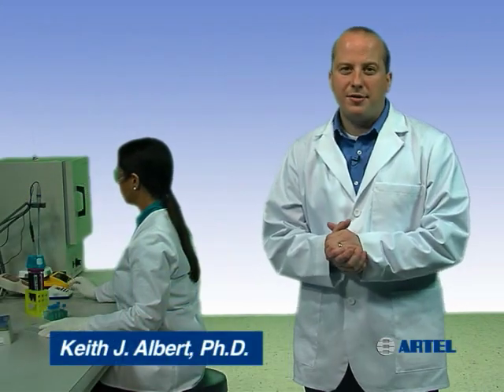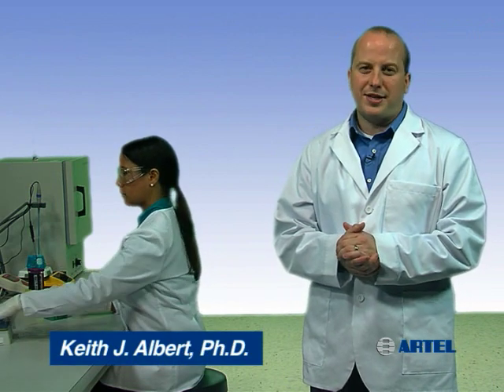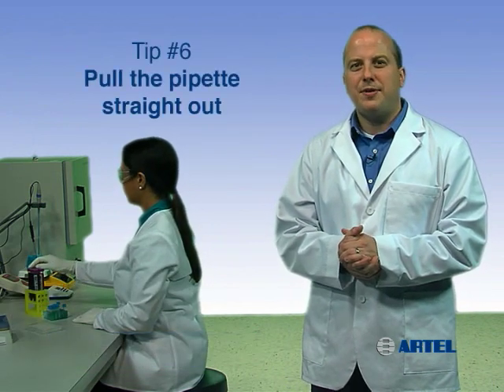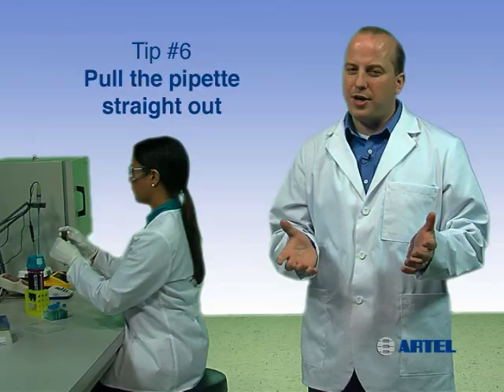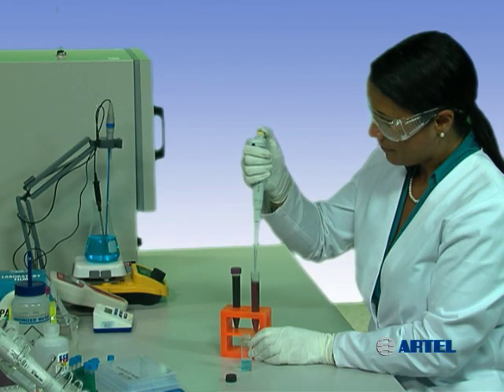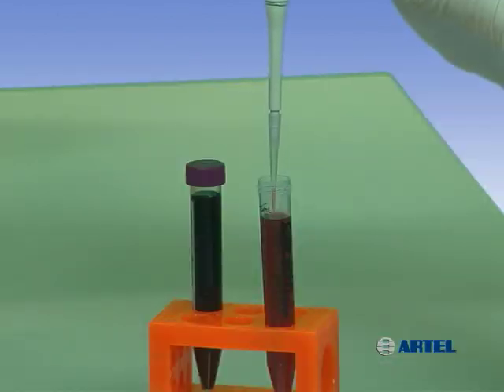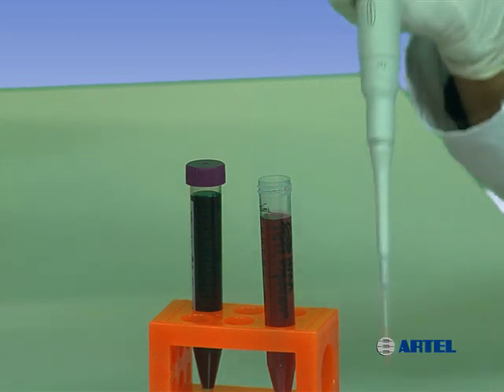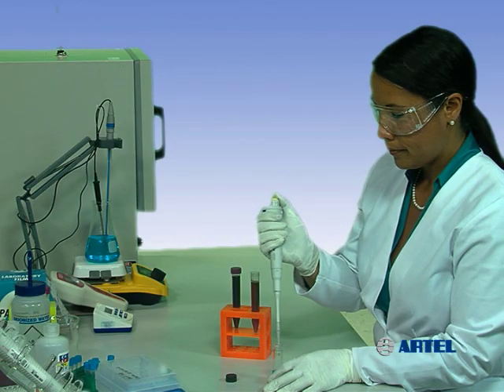Help ensure liquid handling quality in your lab by using proper pipetting technique. Pipetting tip number six: Pull the pipette straight out of the container after aspirating sample. In other words, make sure not to touch the tip on the side of the container as it's being removed.